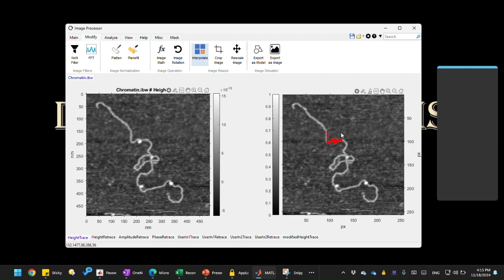To do that, we need to use a technique called mask morphology. So essentially, we need to transform the mask and do all this custom stuff, right? It can do very fancy stuff with mask morphology. You can click the mask tab.